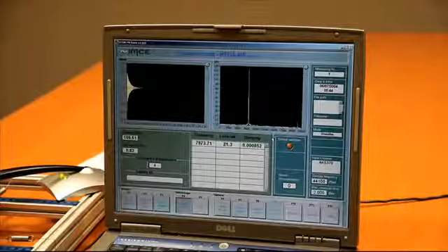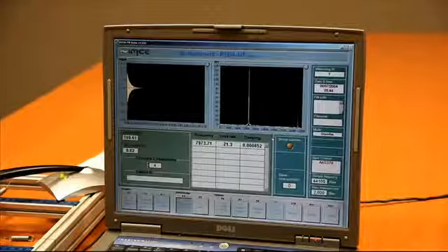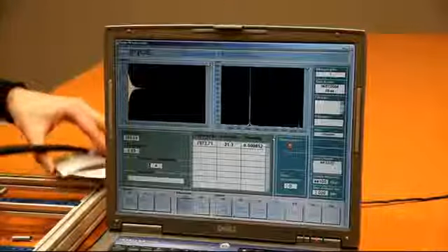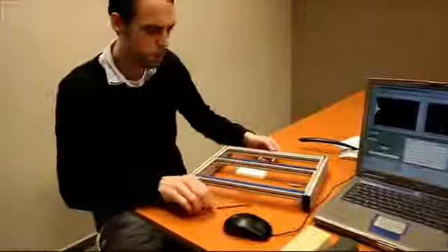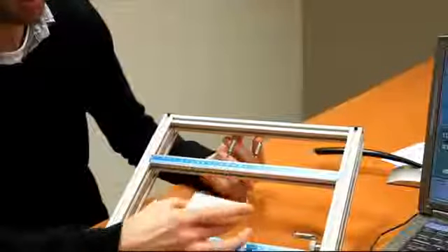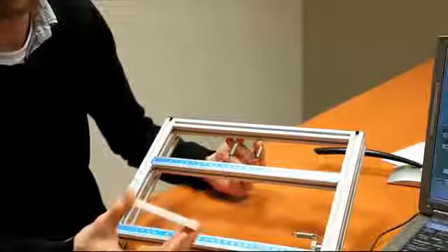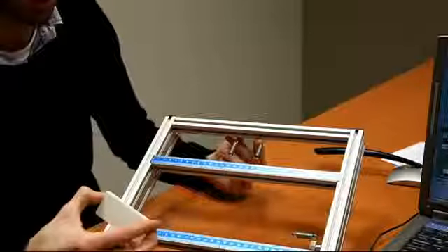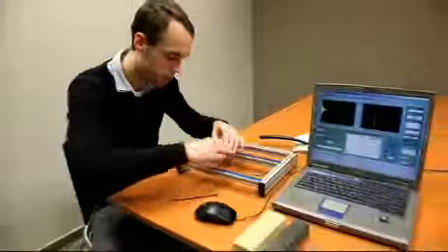We also want to measure the shear modulus and the Poisson ratio. Therefore we need to induce the torsion vibration mode. And to be able to do that we have to change the setup a little bit. So far we supported the sample on two fish wires this way, and to measure the torsion vibration mode we support the sample in a cross like this. So let's change the setup a little bit.